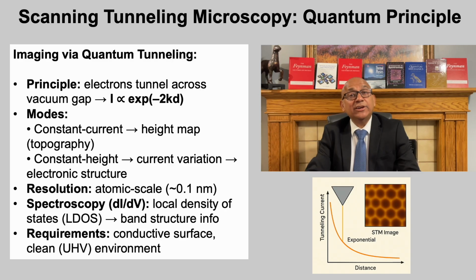STM requires extremely clean, atomically flat and conductive samples, typically metals or doped semiconductors, operated under high vacuum or inert gas to prevent contamination.